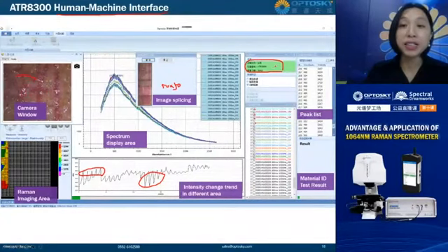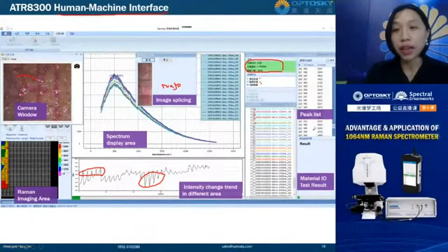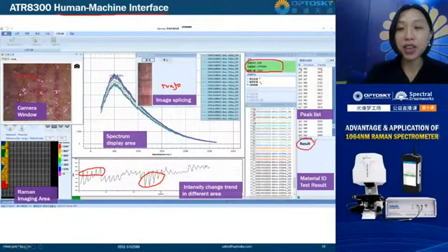If it is not connected, it will mark in red color. And you can also see the raw material and the spectrum data, and also the dark current data. And also here you can read the different peaks with the different intensities. It's the peak list. And finally, you can get a result in here to show the material name.